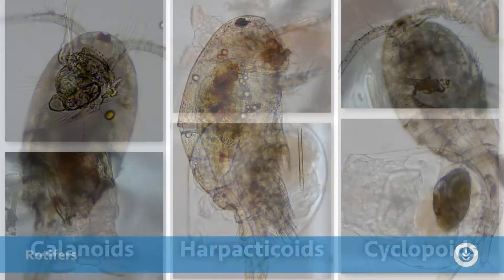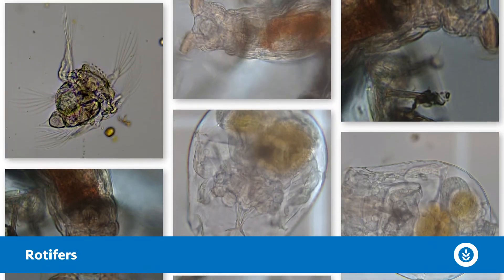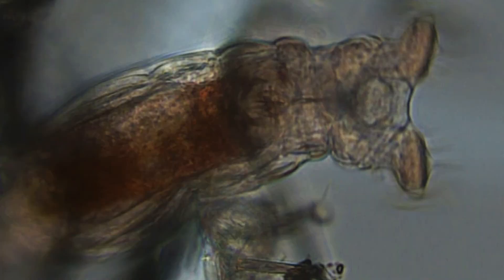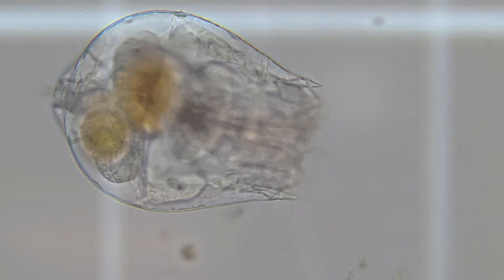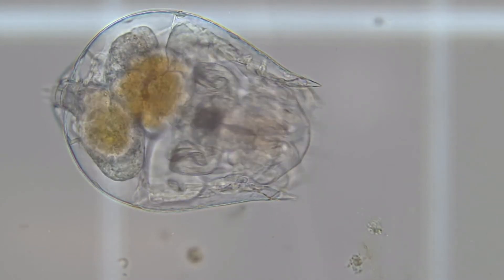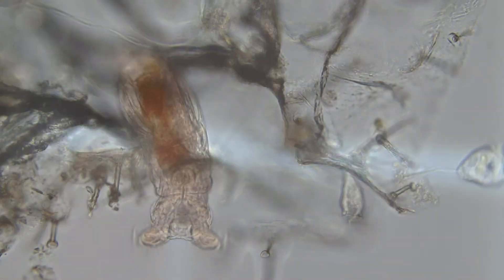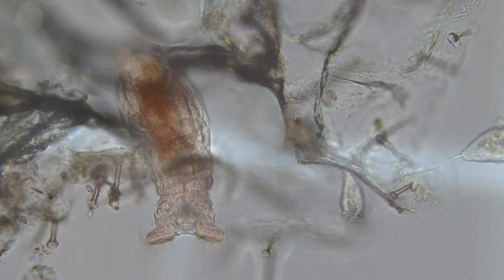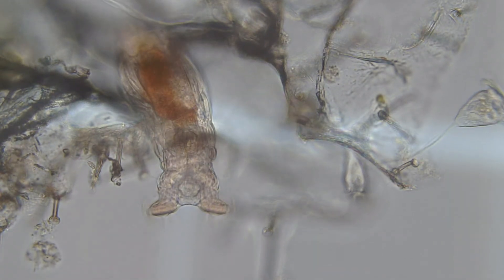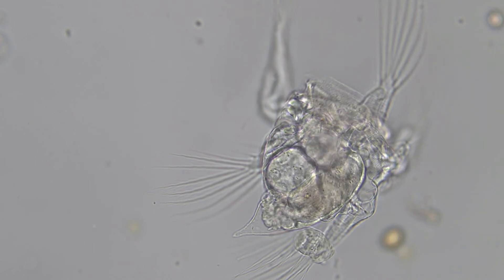Next up is one of my favorites — the rotifers. Actually the world's tiniest animal, they're called wheel animals because they have these rotors that move around, creating a current that brings algae and bacteria into their mouth. You can see those rotors going a mile a minute creating a vortex of water. They're 0.1 to 0.5 millimeters in length — the smallest multi-celled animals on earth — and very common in water resources, with around 2,000 species.